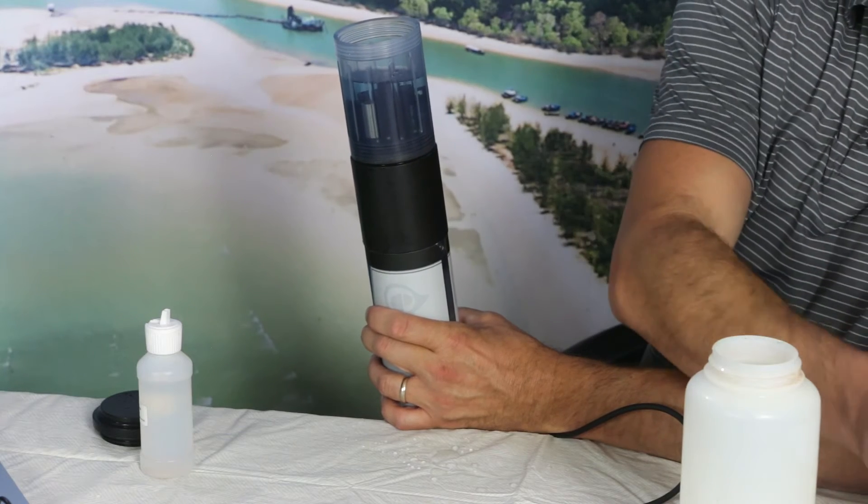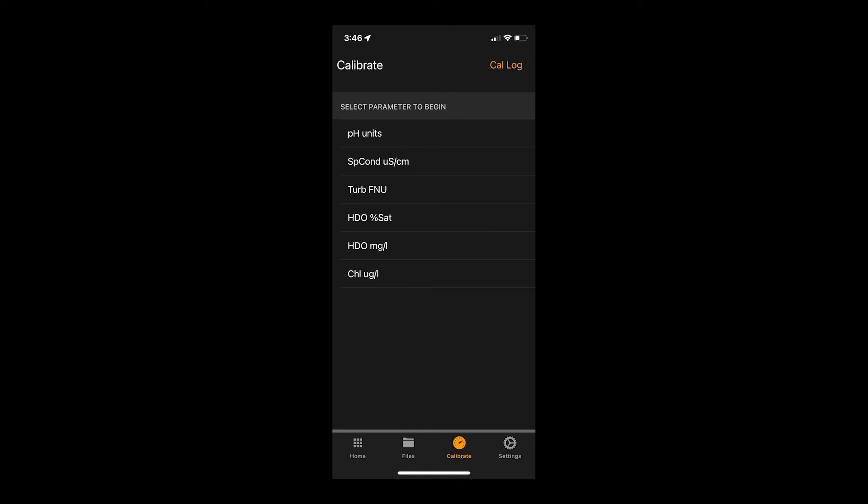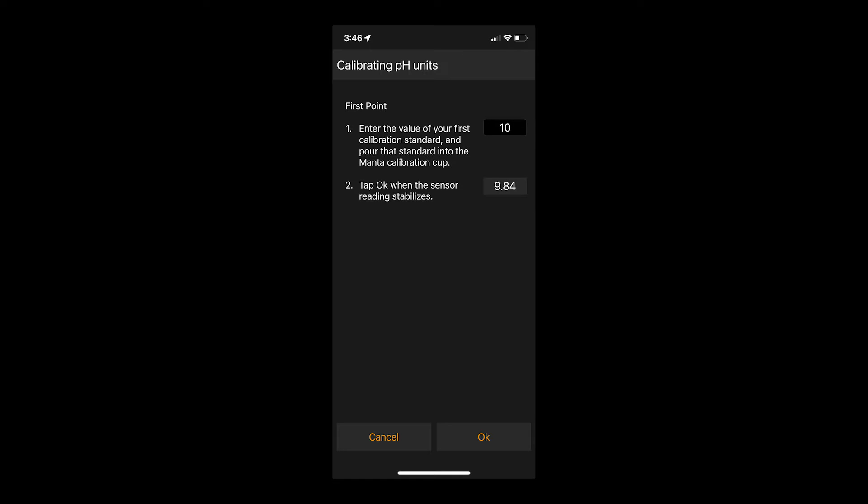Then we'll fill the cup until all sensors are submerged. Tap the Manta Link icon on your smartphone or tablet. Tap Connect at the top of your screen to connect to the Manta Mobile device that corresponds with the serial number on your Manta Mobile device. Once connected, at the bottom of your screen, tap Calibrate. This will bring up a list of parameters to choose from. Tap pH units and follow the prompts on your screen. With your calibration solution in the cup, type the value of that calibration solution in the text field on your screen. Wait for the reading to stabilize and then tap OK.